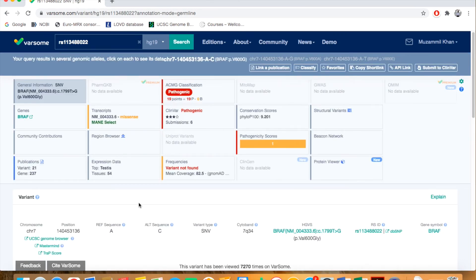Here you go on the result page. You can see according to the ACMG classification, this variant is pathogenic.